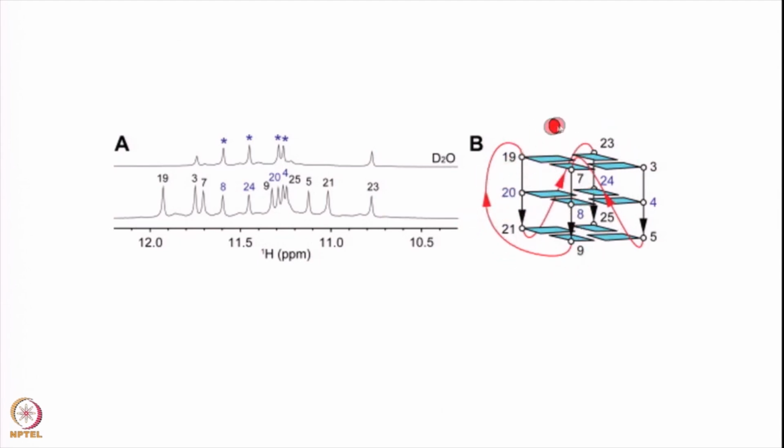Because of that you are seeing all the G's are distinct and they are all present here. You can count here 1, 2, 3, there are 12, 3 here, 4 here, 7 plus 5, 12. All the 12 G's are distinct. These are all found within the same molecule. You have a particular sequence running like this, then you have the loop of this type, then it comes down here like this, then you make another loop like this, and then it turns here, another loop here, and then ends up here.